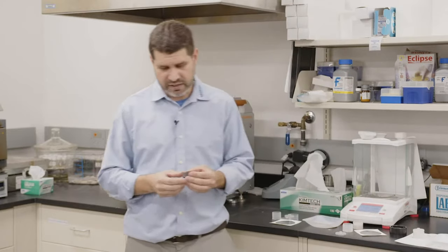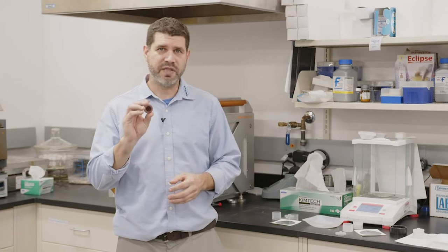Then the next way of running a sample is by fused beads. And how to make a fused bead is basically you take the sample, you heat it up in the fusion machine with lithium tetraborate, lithium metaborate, and that will form the glass bead that we see here.